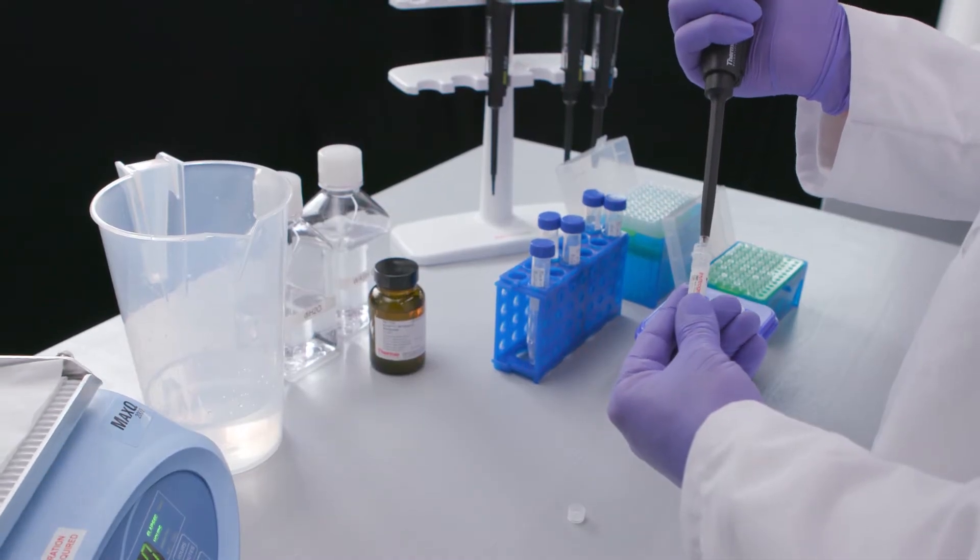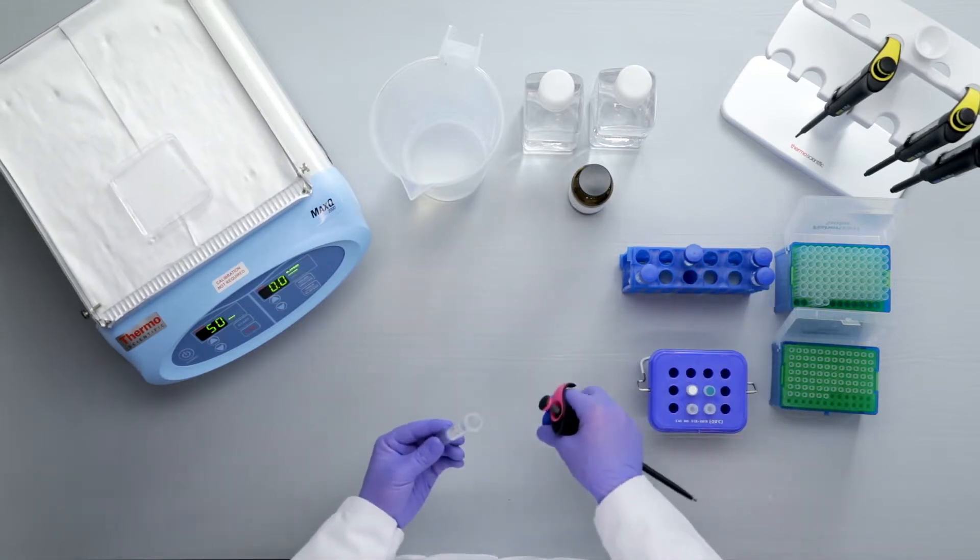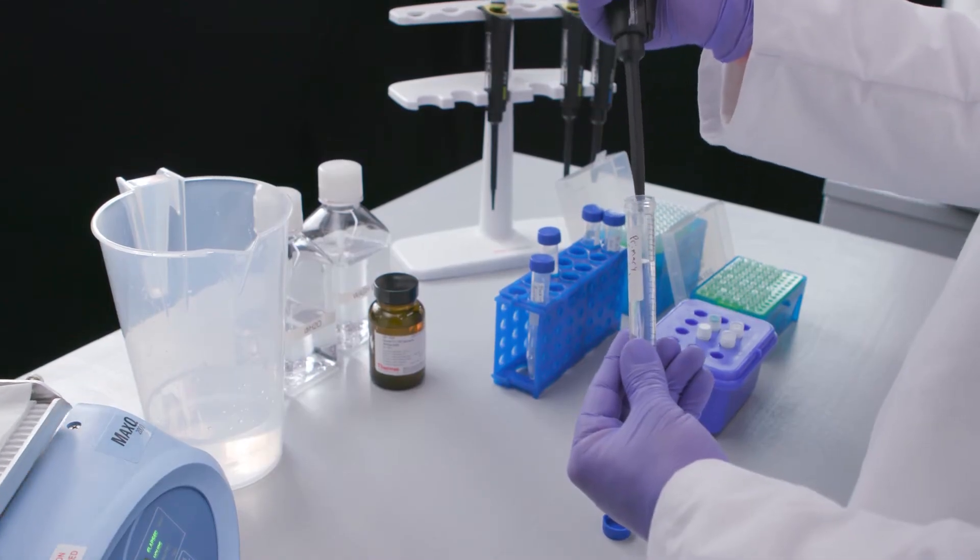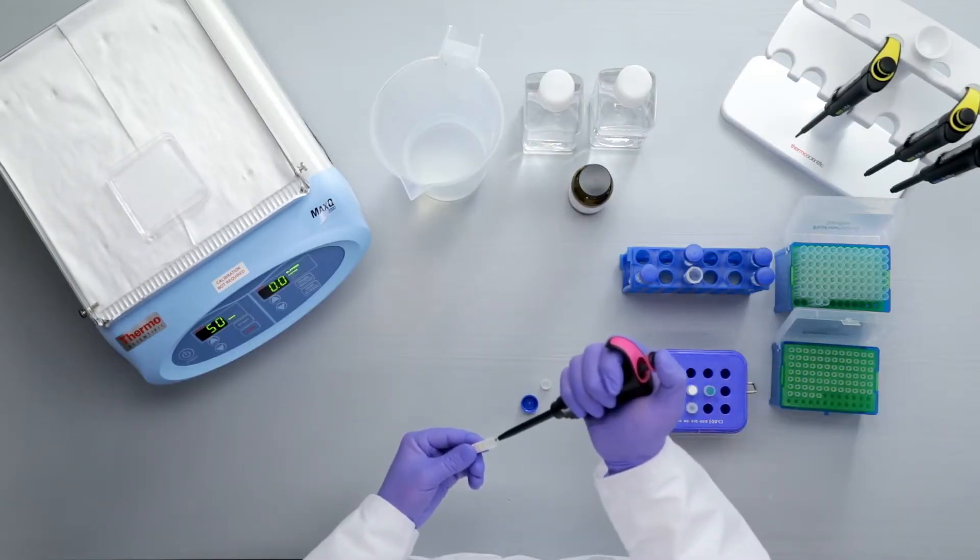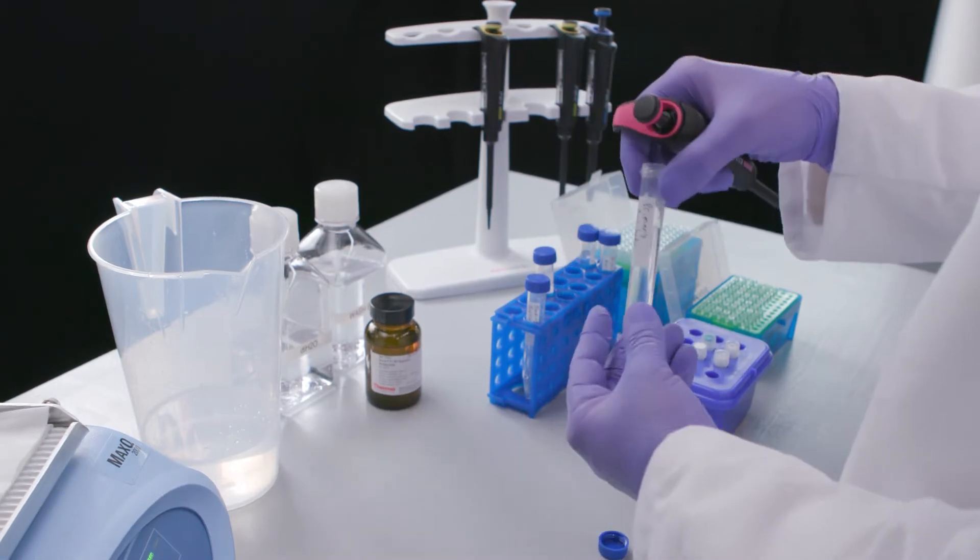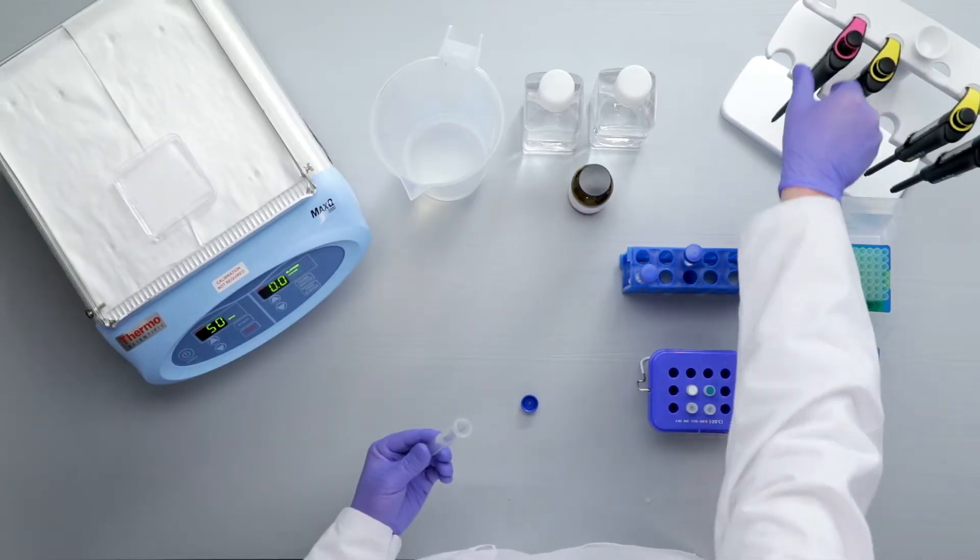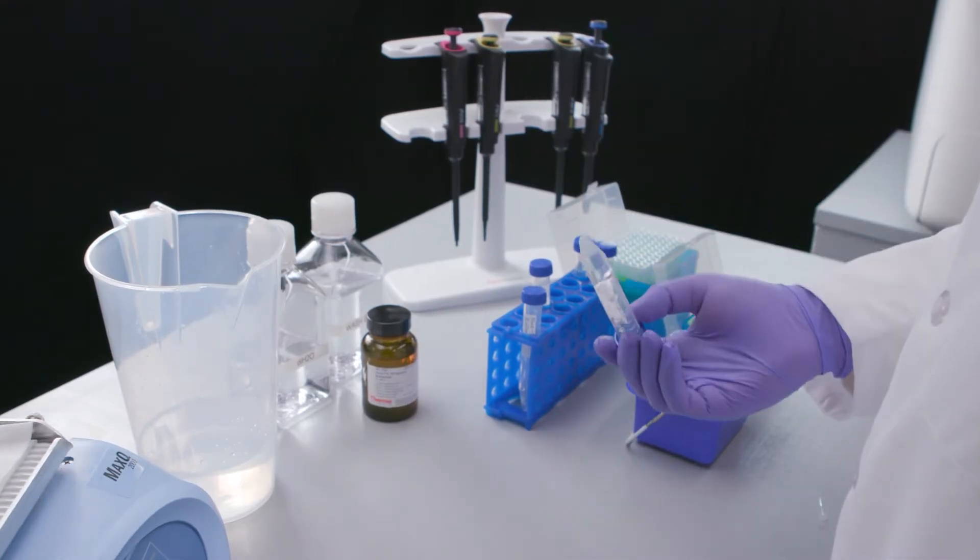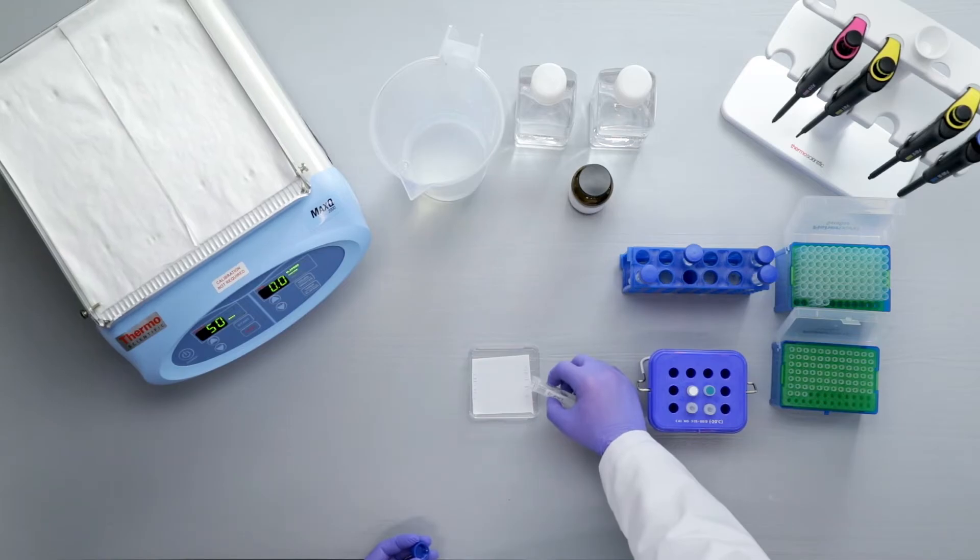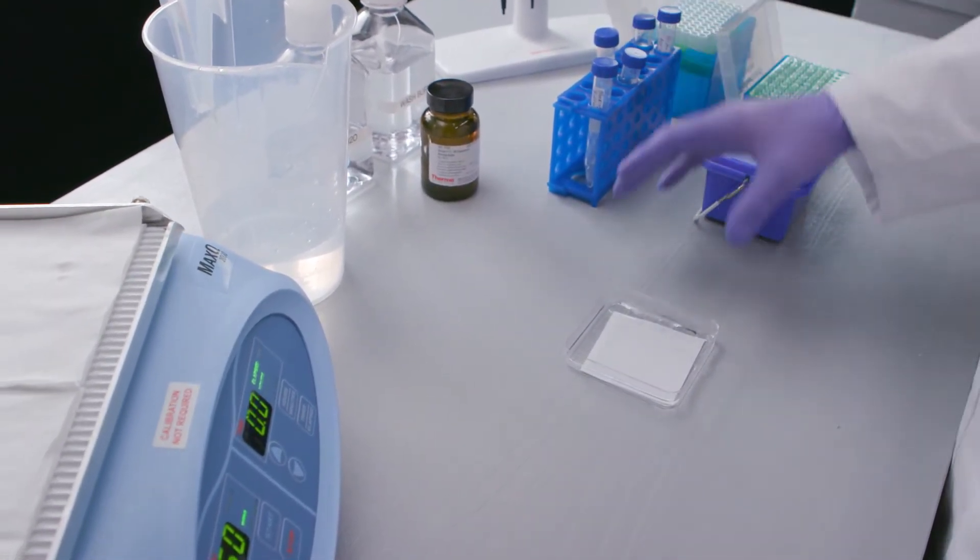Dilute the two primary antibodies per supplier recommendations in sufficient volume of blocking buffer. Incubate the membrane with gentle agitation with the primary antibodies for one hour to overnight. When incubating overnight, place at 4 degrees Celsius.